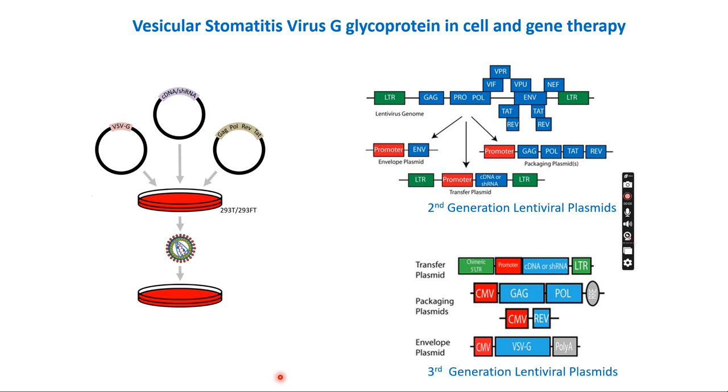And to check for safety, from several approaches, we can test for VSVG, which is a very key component in making this viral vector. Since we need very high accuracy, I always recommend using ddPCR to detect VSVG.